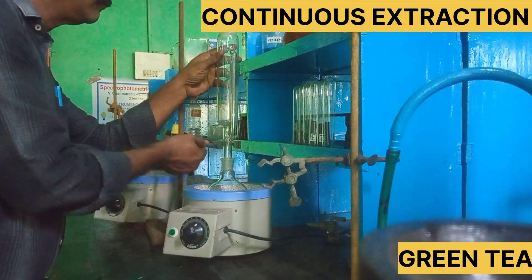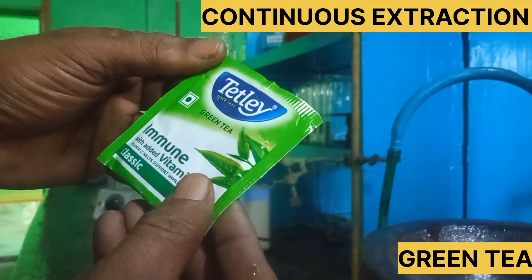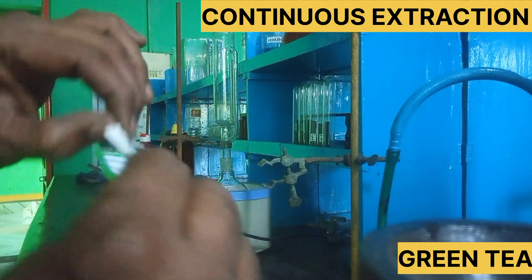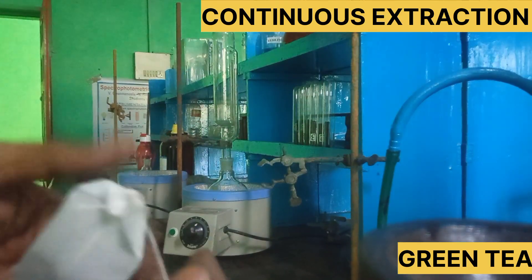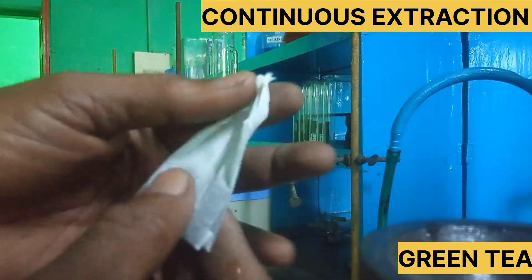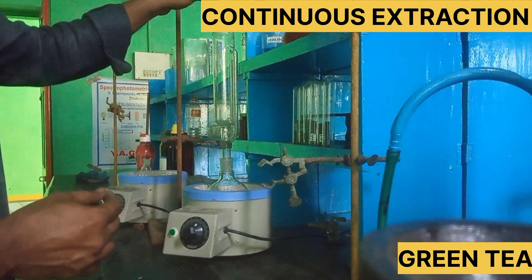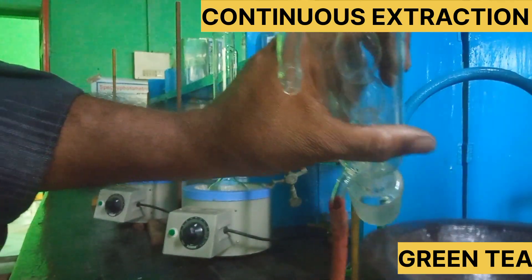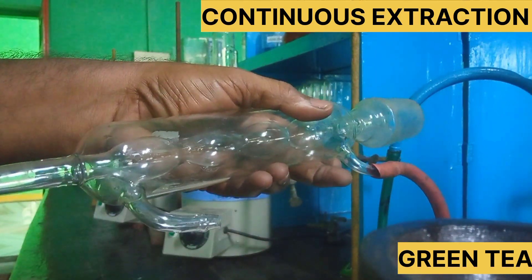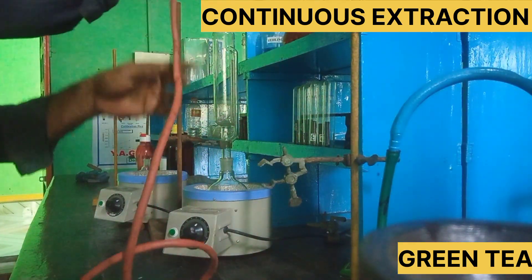We use a heating mantle and fix the apparatus in it. Then we fix it in the container. After that, we have a green tea packet which we place into the container.